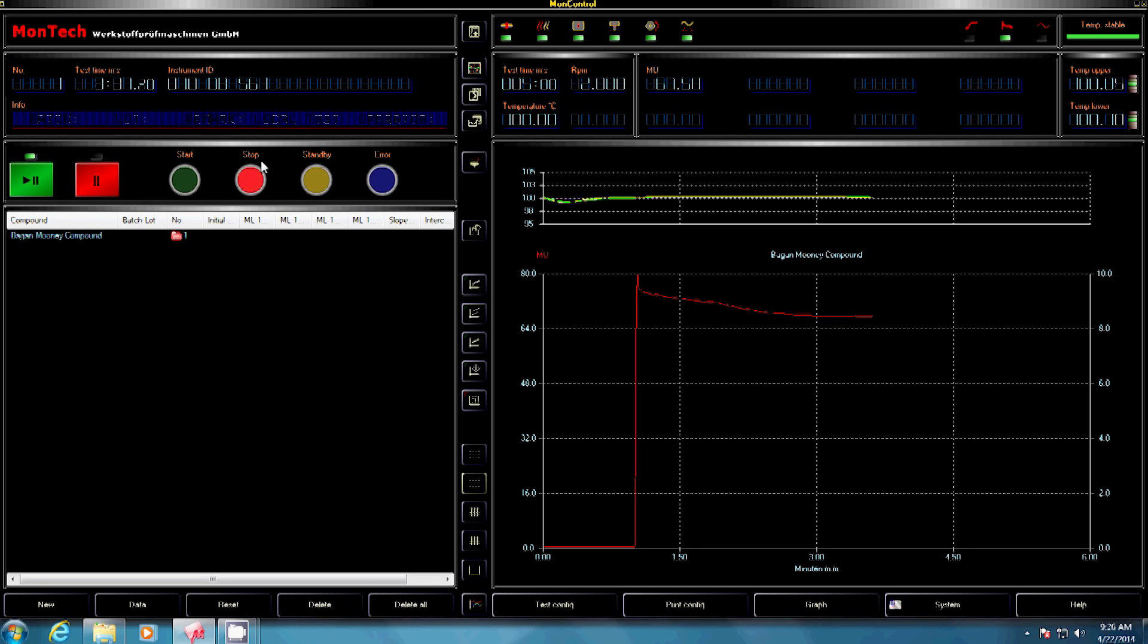Optionally, stress relaxation can be measured by stopping the rotor after typically four or eight minutes test time and measuring decay.